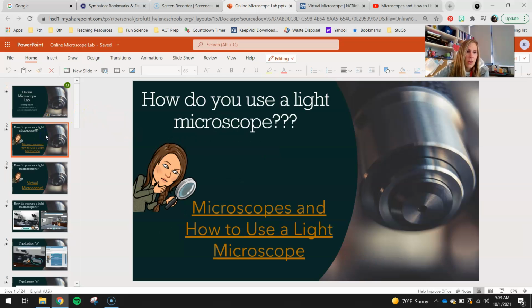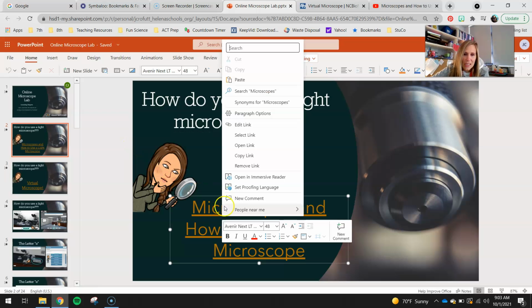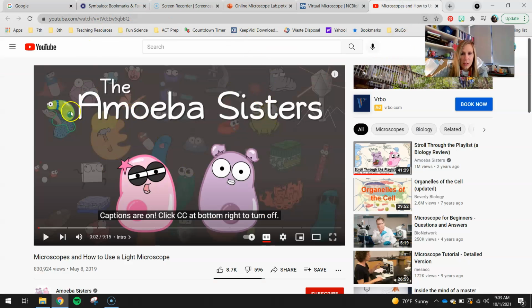Okay? All right, so the first thing you want to do is obviously learn a little bit about microscopes. You are going to right-click this handy-dandy link right here and open it up, and it's going to take you into this Amoeba Sisters YouTube video. So you can go ahead and watch it.